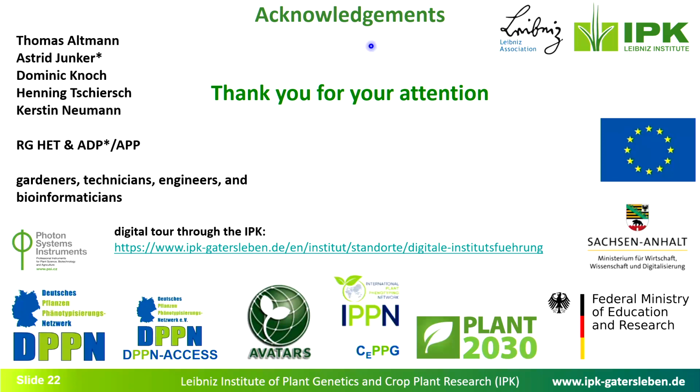Yeah, so the wind movement, we are quite lucky because, as specifically said, we can simulate an IPK field scenario. We also tracked the wind movement over all these years because our weather station tracks that. And what we found is that the wind comes from 2 opposing directions and changes every couple of days, basically. And there's not much in between. With 2 opposing fans, we can simulate that. But we ramped it over the day. So we had the highest wind intensity at midday and the lowest wind intensity at night. But even at night, we had wind simulation.